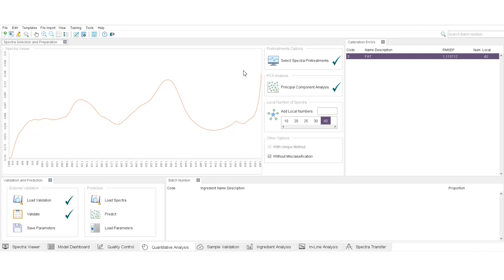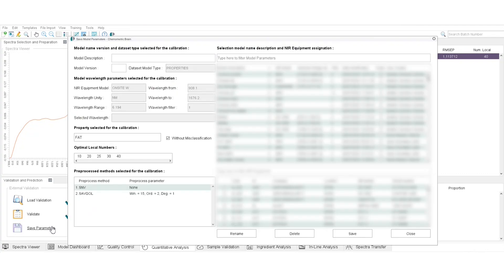Step 1. Inside a quantitative analysis tab, click on Save Parameters and a new pop-up window will be opened.